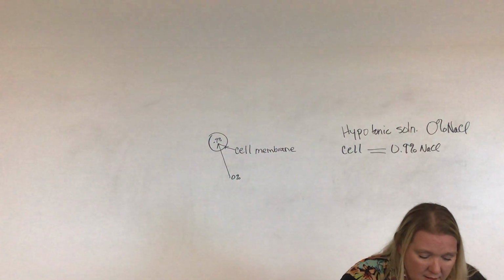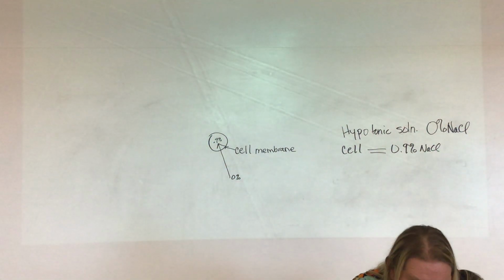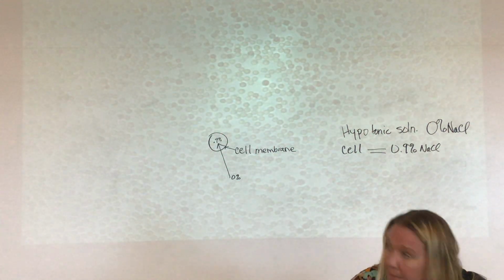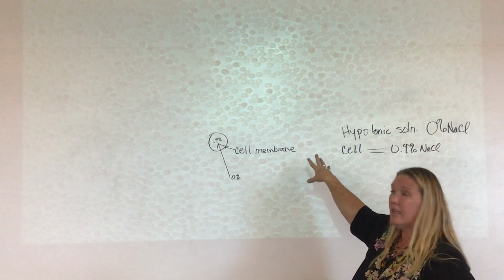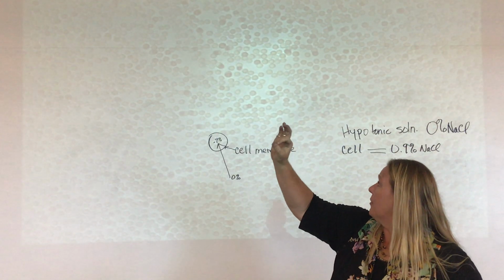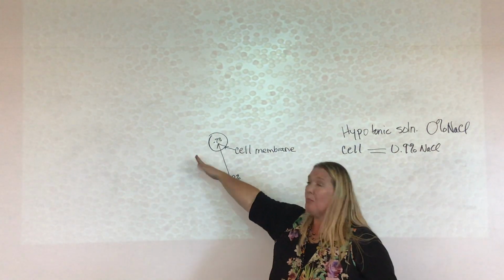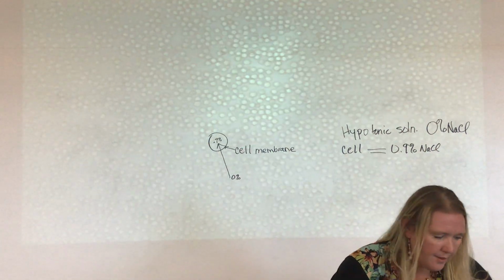Like we saw in those healthy cells here, right? The healthy red blood cells, right? In the isotonic solution, okay? Where they're nice and round and a good solid circle where you can see this depression in the middle, okay? All right, so movement of water.